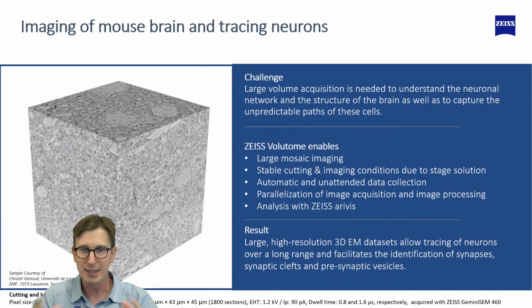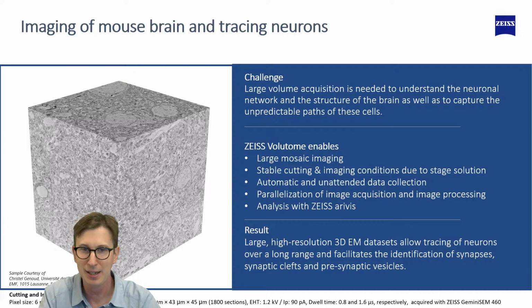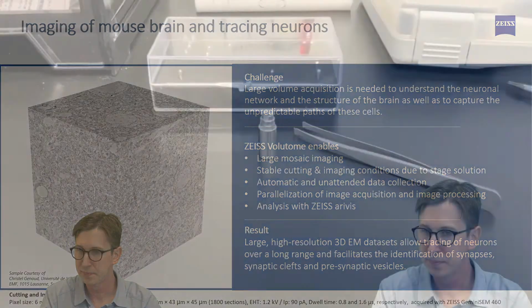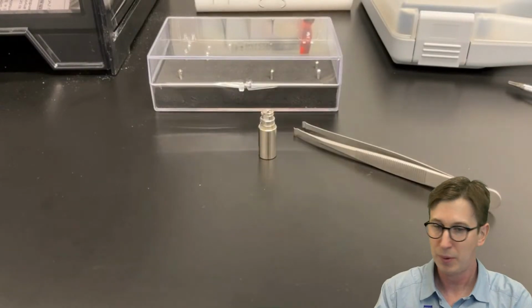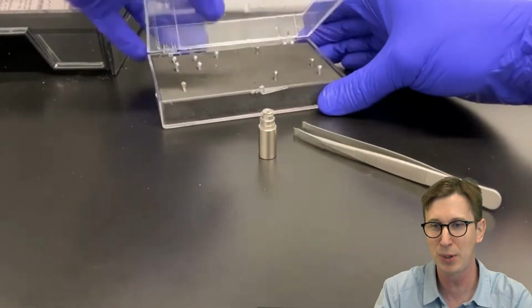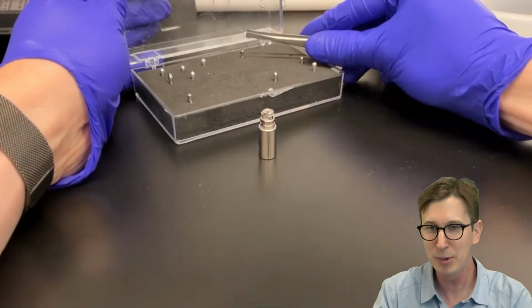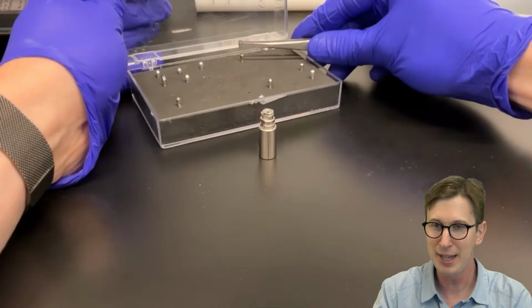Now, as I promised, I want to give you a little bit of behind the scenes look of what does it take to start getting these data. So this was yesterday. I've put on a sample to prepare for our demonstrations we're going to do at the Society for Neuroscience conference virtually. And I'm grabbing the sample pin. So that's in the back there.